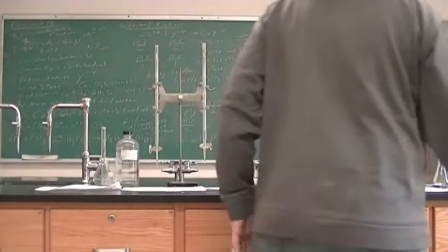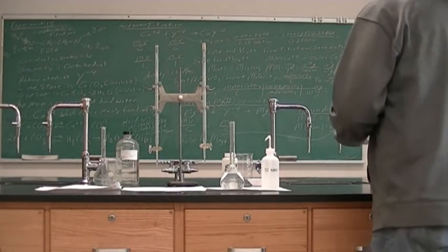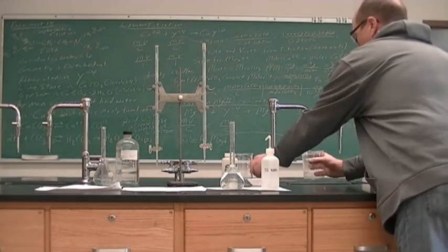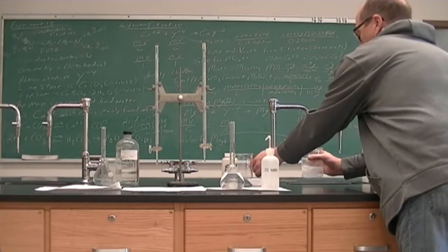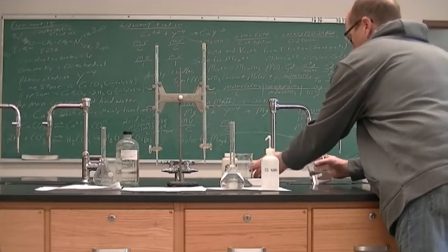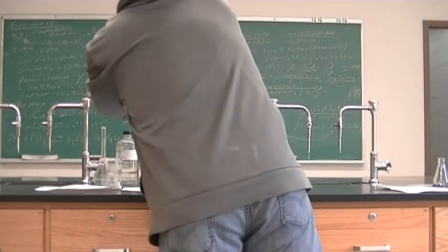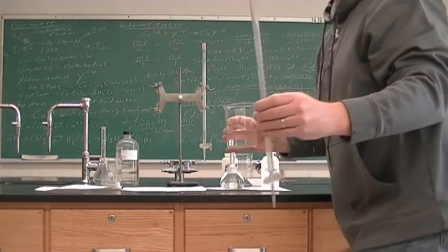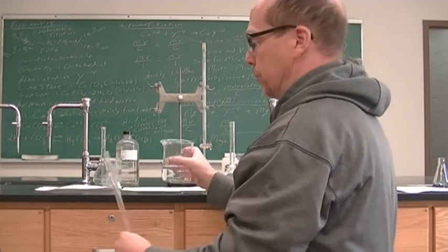All right, so I'm going to get my water sample ready. I'm going to just take the tap water, and I'm going to use a burette rather than a pipette. It seems very odd that I'm going to thrice rinse my burette with tap water, but that is what I'm going to do, right?